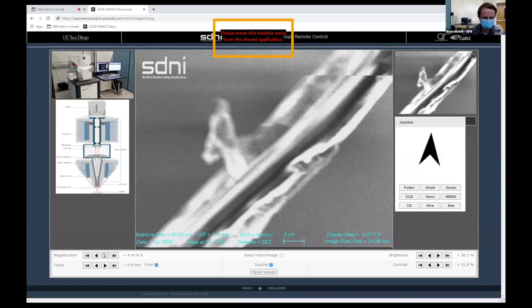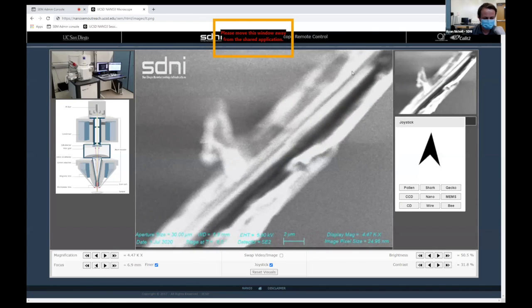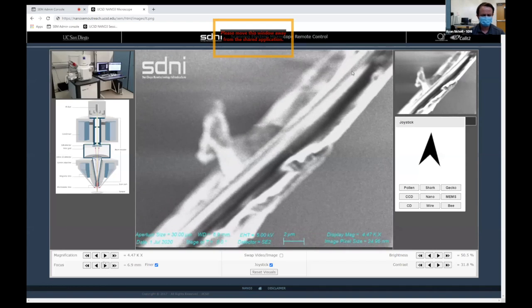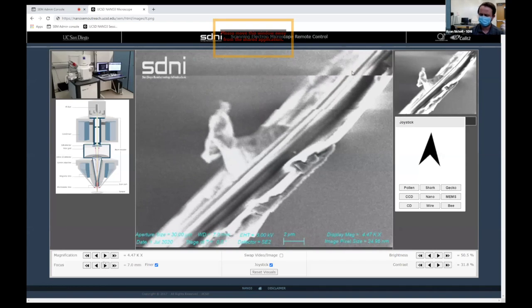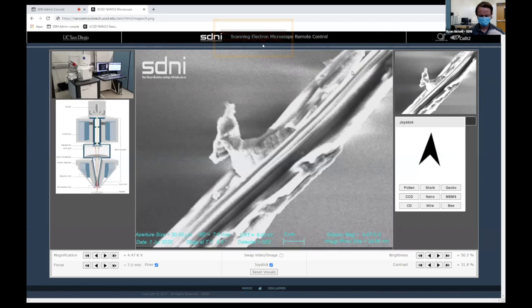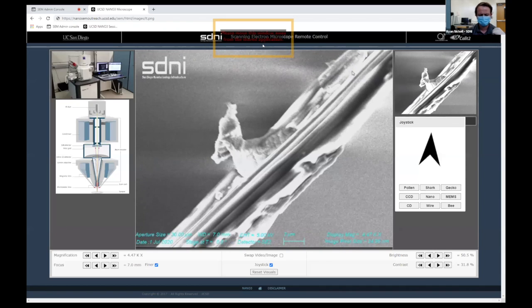Yeah, we're almost seeing all the detail here. And we're starting to see some interesting effects, which is another thing that we can go into if there's people interested in material science or electrical engineering. We can talk about why we're seeing this glowing. This is all to do with how the electrons are interacting with this non-conductive organic material. And this is another sort of problem or barrier that we have to surmount whenever we're using an electron microscope.